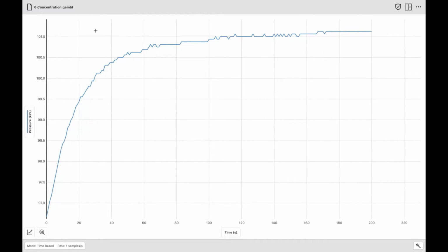The next part of comparing data or concentrations is we change the H2O2 to 6% concentration. We're now going to look at the data to see if we had a faster rate of reaction with the 6%, the 1.5, or the 3%. So we're going to choose the area that we want from 40 seconds to 200.